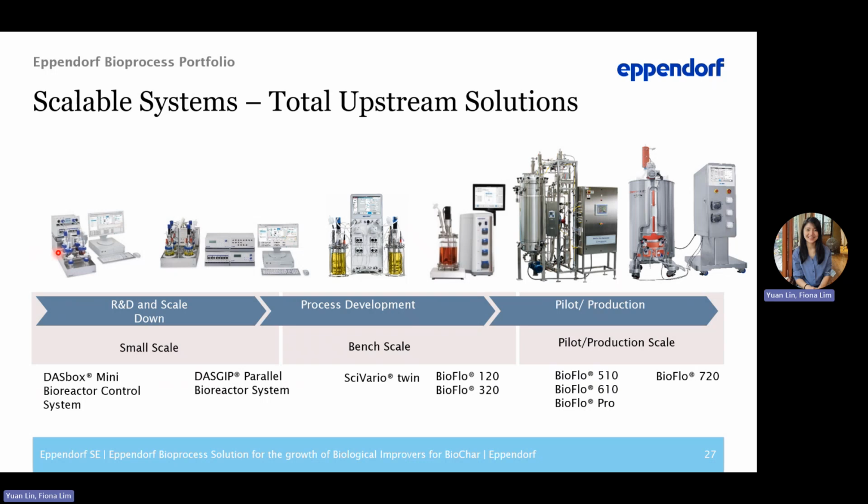let's say we do not know what is the best condition that we want to culture for this cell line, or if we have many different cell strains and we want to see which are the best cell strains that we could potentially introduce to our experiment, in that case, this kind of parallel bioreactor is very useful because firstly, it helps operators to save a lot of time and also a lot of cost in the media, as within one run you can run up to 4 parameters and 4 bioreactors, as opposed to, let's say, the bench scale system.